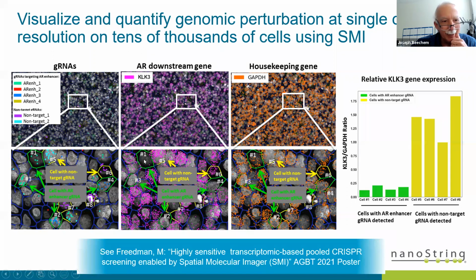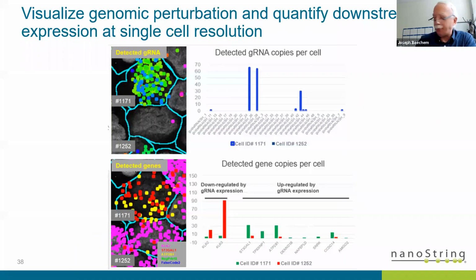And just convince yourself that's not a dead cell, number 1, that just doesn't have anything in it. You can read over here, the housekeeper associated with cell 1 is still there. So here's the housekeepers going. There's the lack of a knockout, it's not there. Here's the guide where it is. There's the functional effect of that guide. So you get all this high density information, and it's all self-contained in a single experiment. All the controls, the functional readouts, all that stuff is controlled. So it's really a high efficiency way of getting information out on these types of screens.